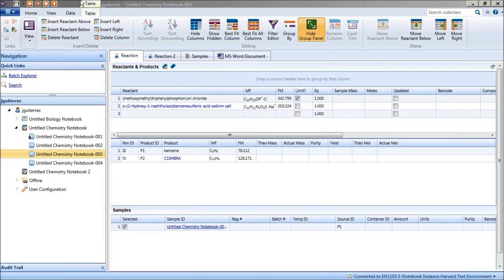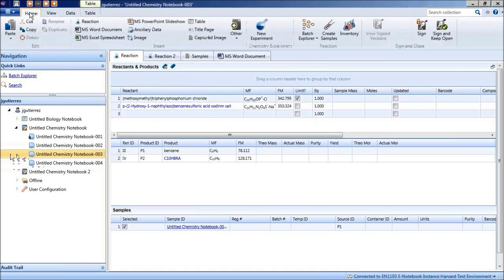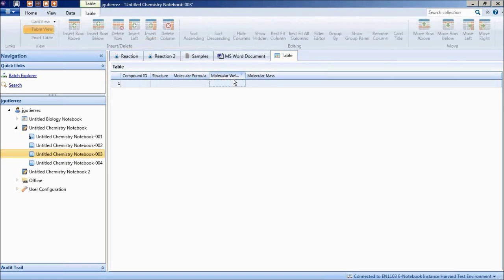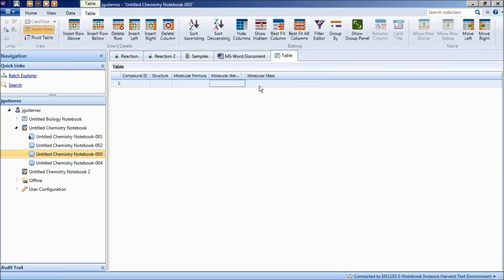This control is available in all the sections and all the fields in which you have tables. And also if I have a table field over here, you will see that you can do exactly the same, the grouping and moving the columns left to right and so on, in all the fields that have different levels, the table field. Okay.